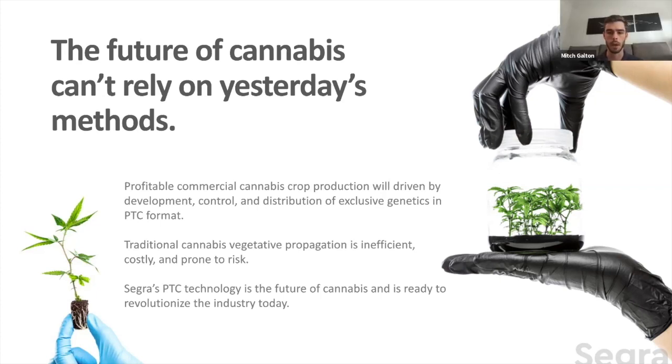Awesome. Another one back to the DNA fingerprinting. Do you DNA fingerprint every plant before it goes to a customer? Is that standard SOP for anything leaving the facility? We don't do every plant. We do the regular auditing for each batch. Generally, if it's a bigger batch, every 50 plants we take one sample. And every 2 to 3 months, we repeat the program and see if any variation is happening.